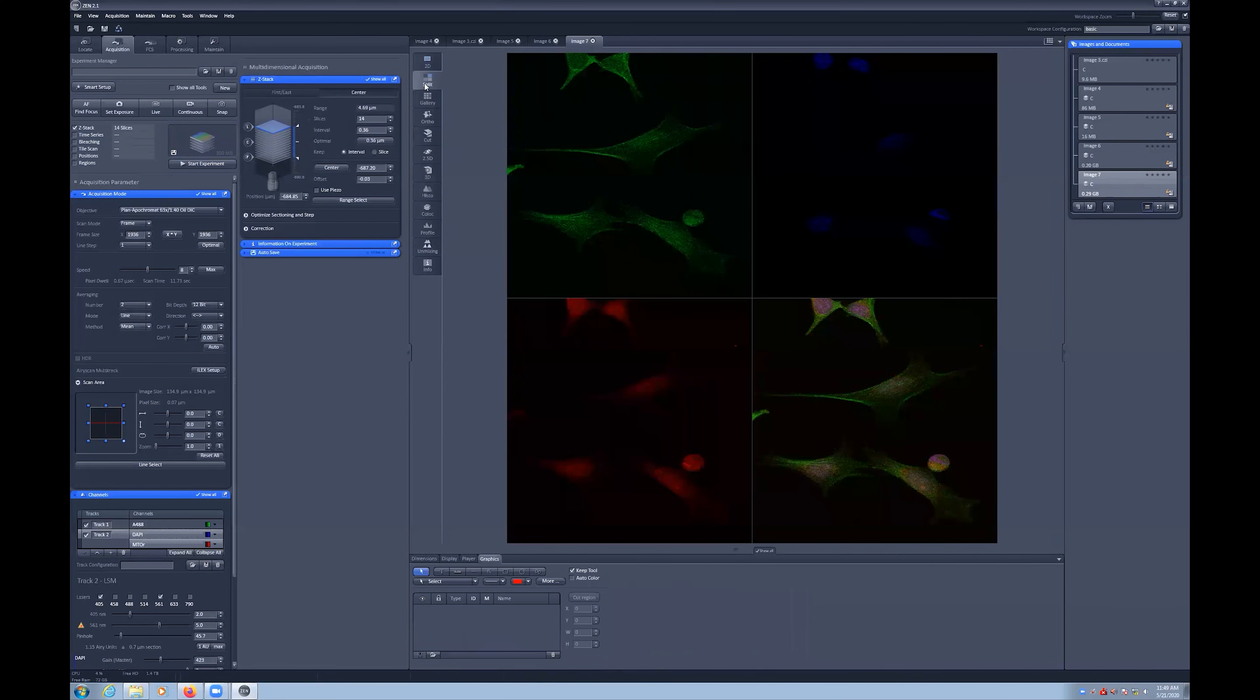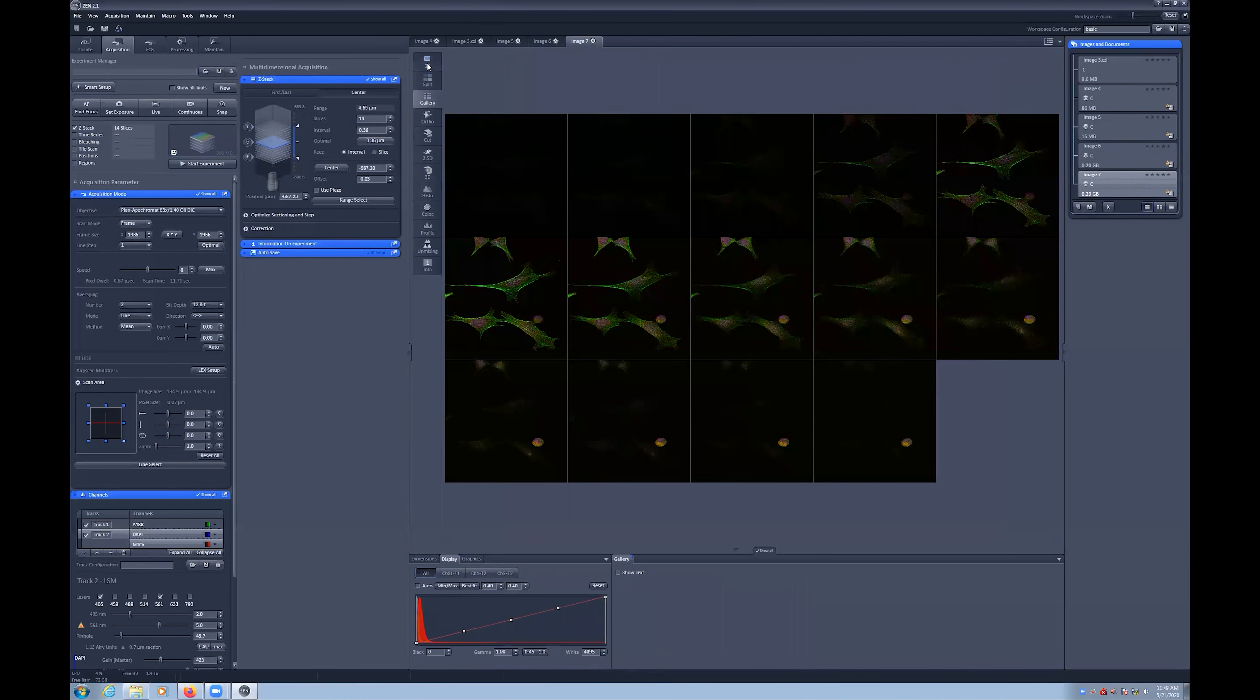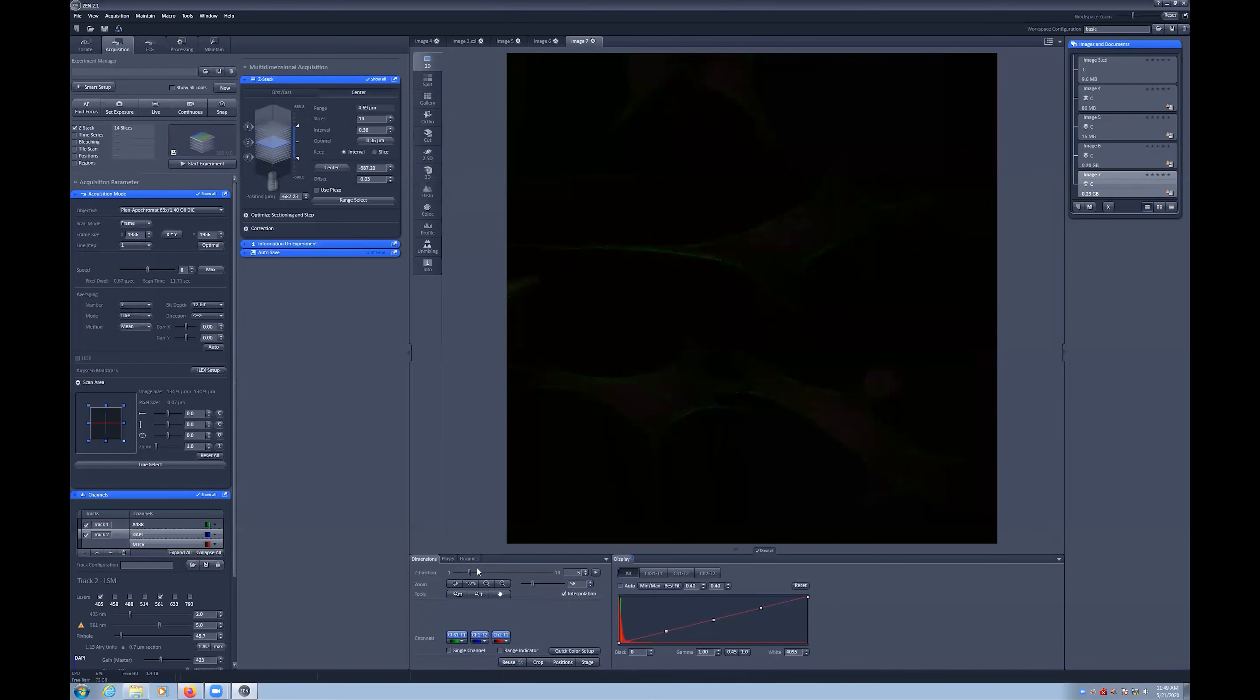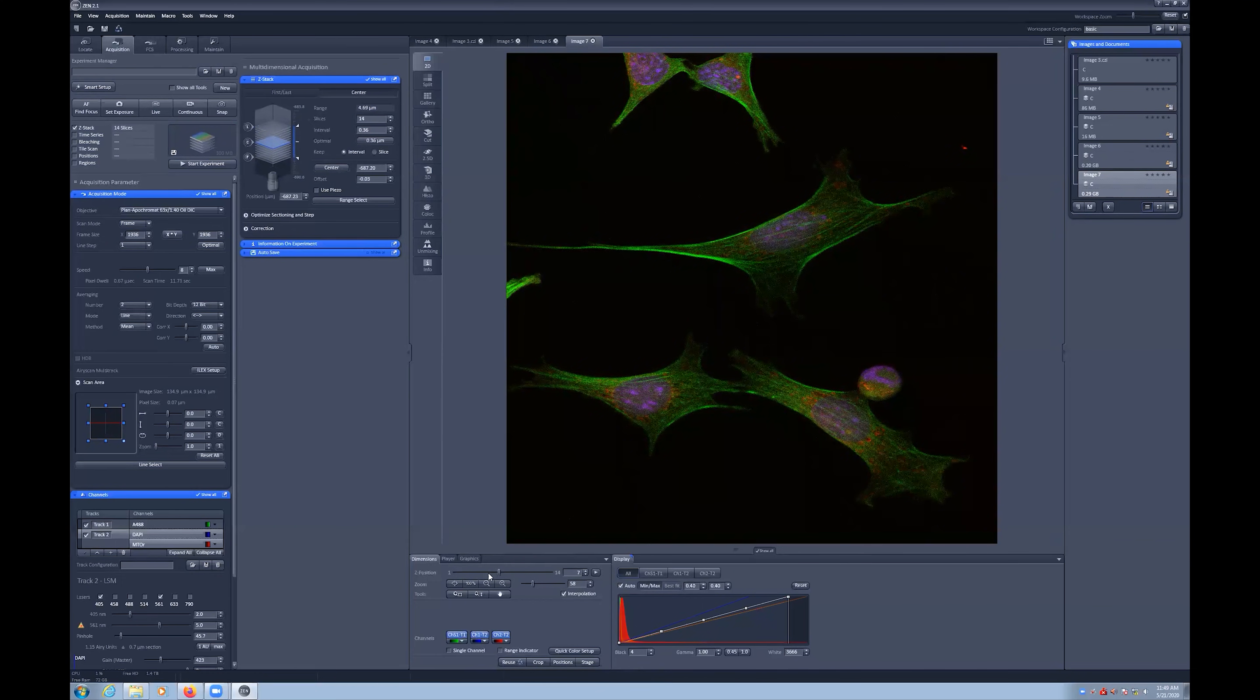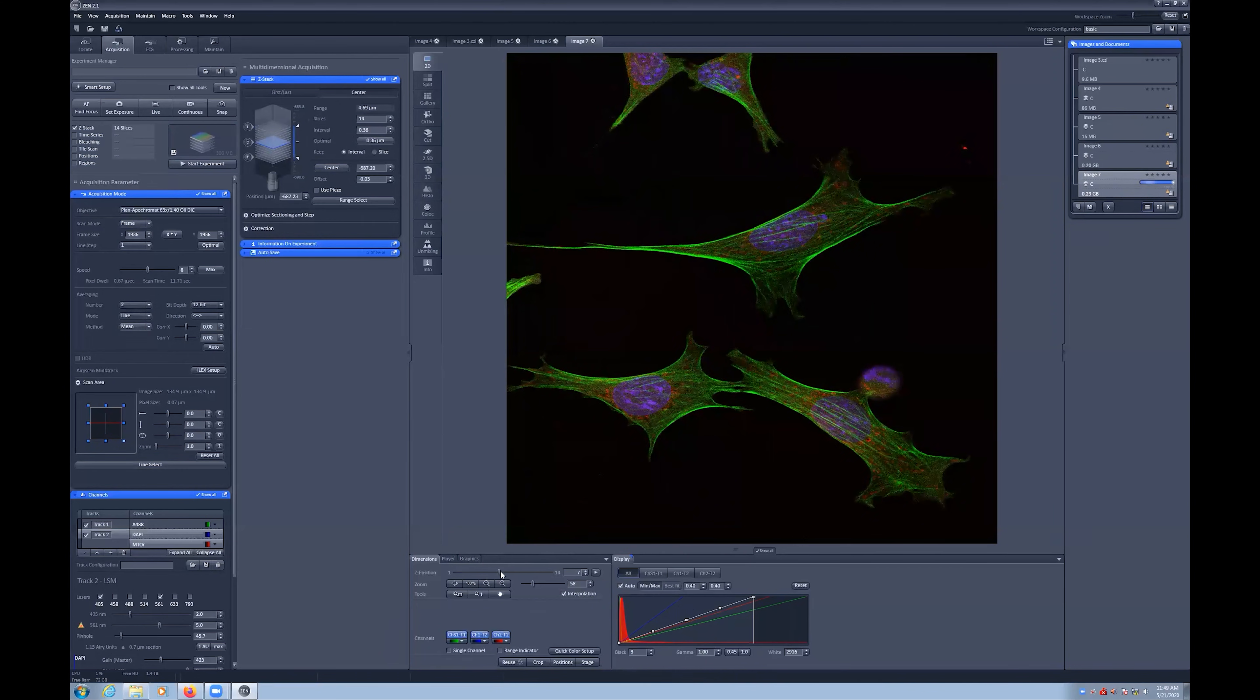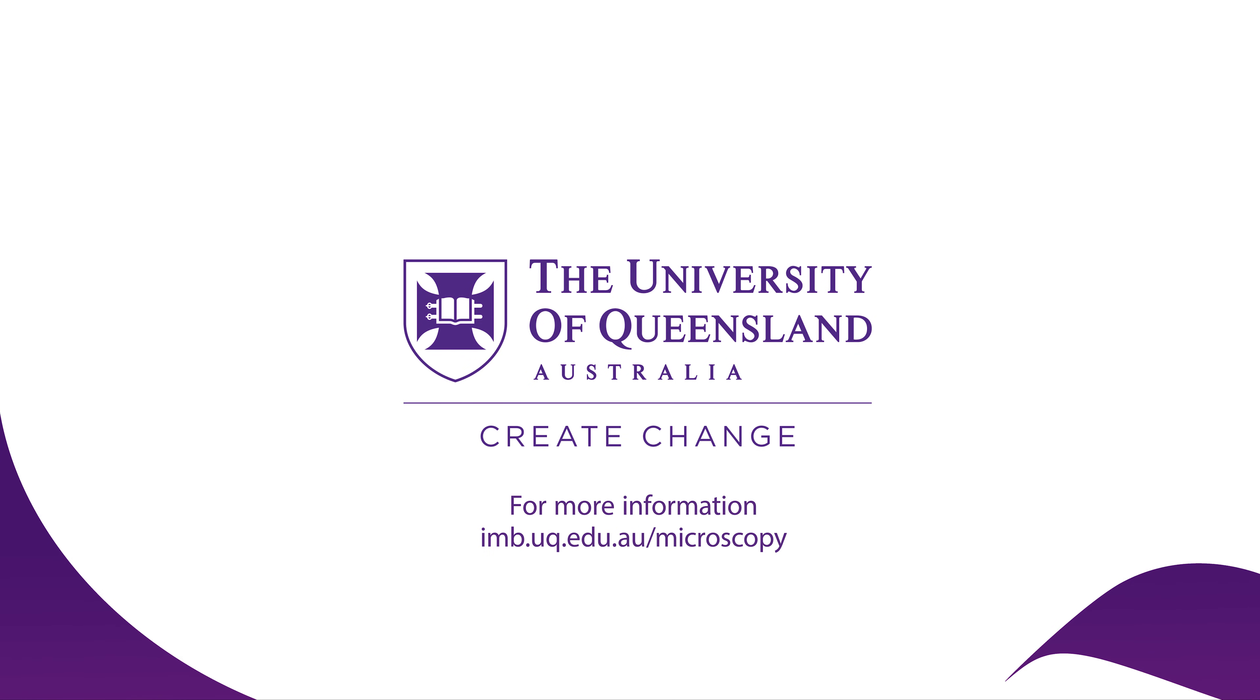Irrespective of the Z-Stack acquisition method used, you can gain access to the Gallery Image tab and a slider at the bottom of the screen in the Dimensions tab to explore your data. You can also use the Auto Scale button for display adjustments.